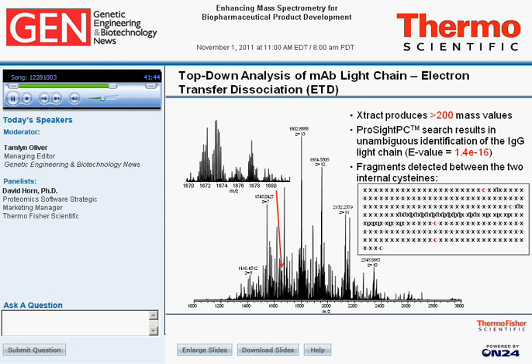So we took that intact protein and we did electron transfer dissociation on it. You can see what the MS/MS spectrum looks like down below. It's a very high complexity. Also, the fragments have very high signal to noise. And if we just take any region of the spectrum and zoom in, you can see that there's lots and lots of information. In this case, it's about 12 Thomsons wide. There's at least 10 isotopic clusters in there, if not more. And there are locations where those isotopic clusters overlap each other in m/z space, which means you need extra high resolution to make sure you can identify those isotopic clusters.